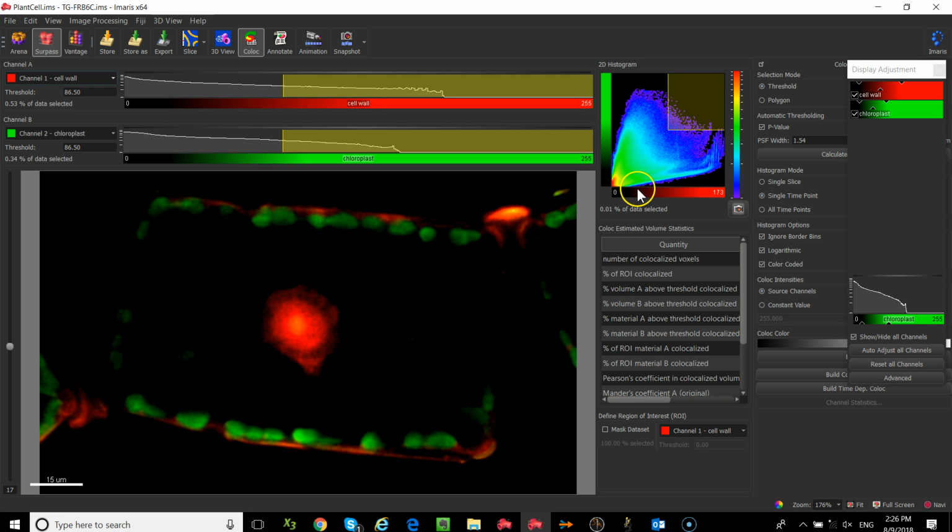So ideally in a world of colocalization, you would want a little 45-degree line, but no one ever sees that, so perfect world. What I want to show you here is ideally what you want to do is select your thresholds for channel A and channel B. You can do that manually. You can type in a value over here, but you can also use a tool in this window that allows you to draw a region around the structures of interest. And what it does is it extracts the minimum intensity value within that region and sets that for your threshold.